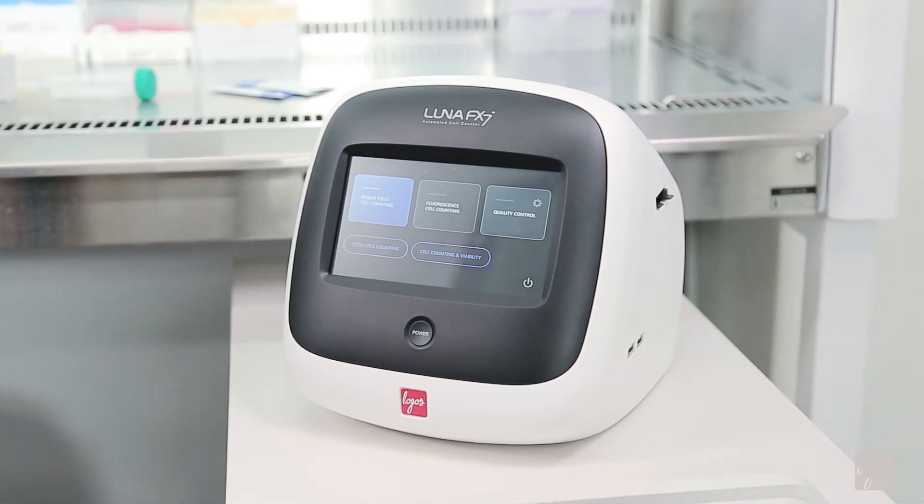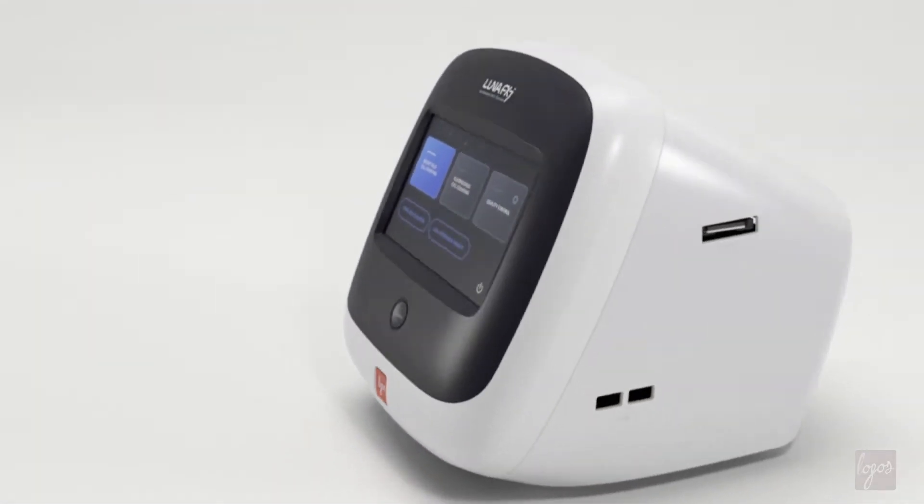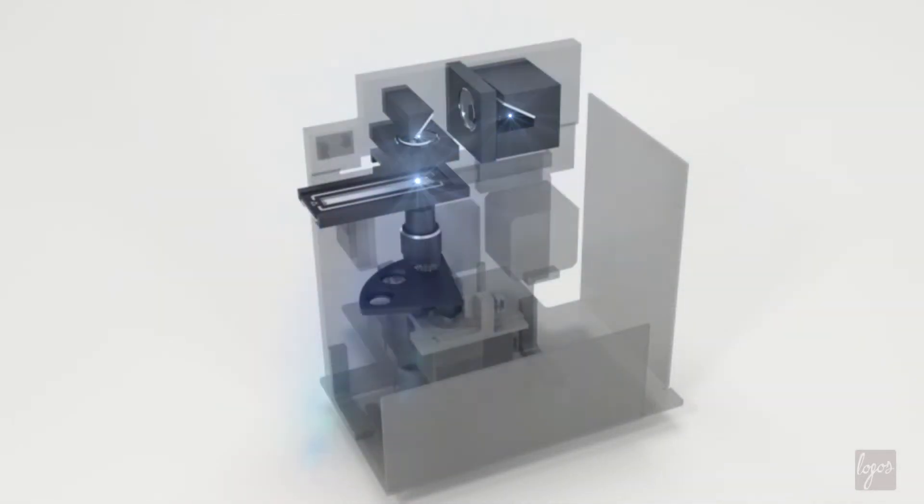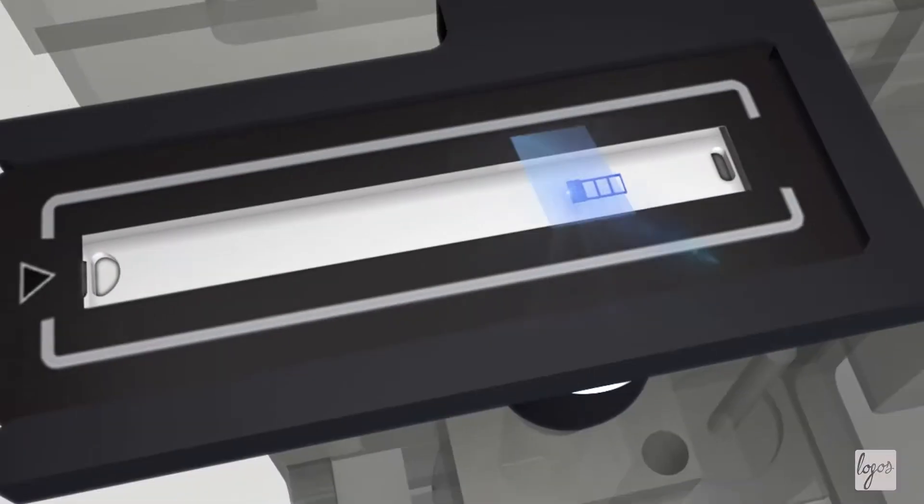The LUNA FX7 will simplify your lab's workflow. The new one-time slide insertion feature enables you to count all the chambers at one time without having to remove and reinsert a slide.